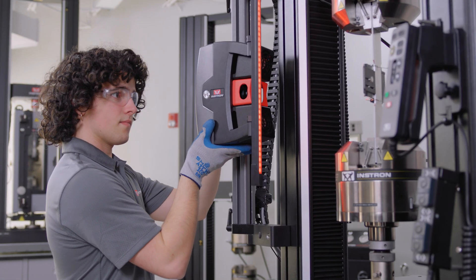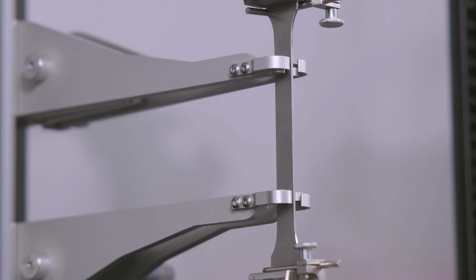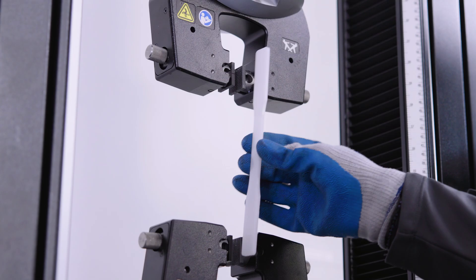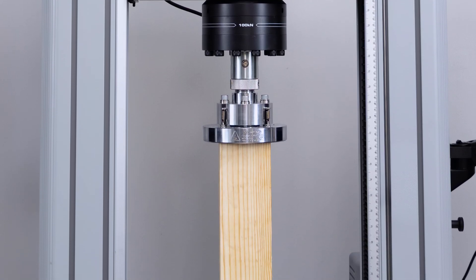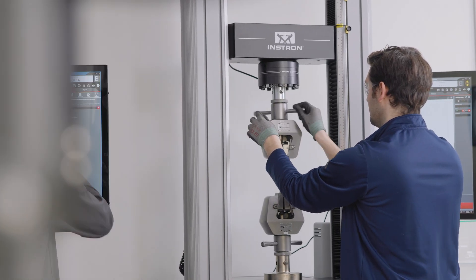The new 100 kilonewton models also maintain compatibility with nearly all of Instron's 100 kilonewton accessories for testing high strength alloys and composites. In addition to hundreds of other accessories for testing plastics, elastomers, and any other materials or components, making it one of the most versatile and capable universal testing machines we've ever developed.